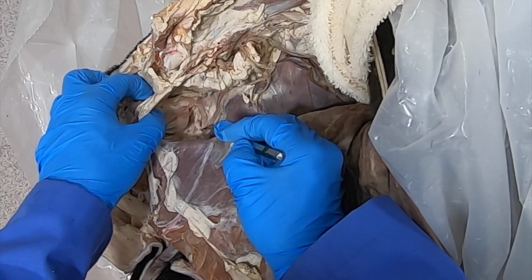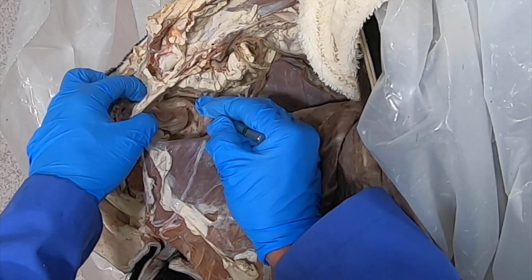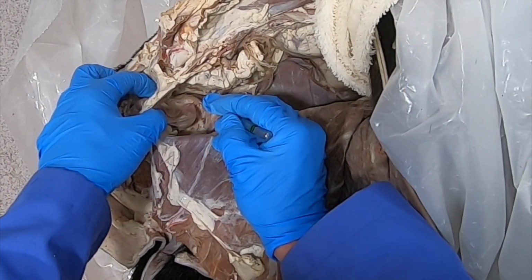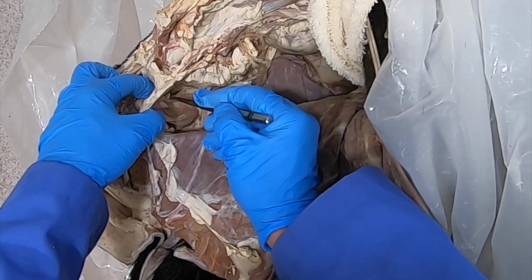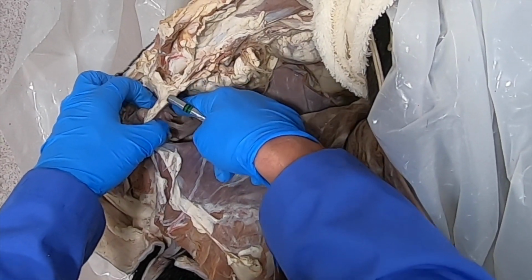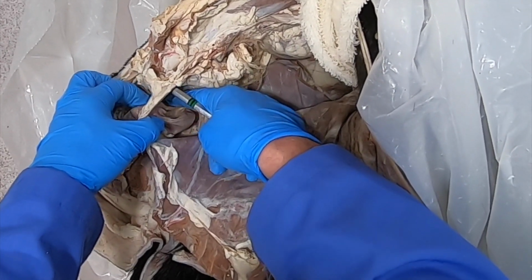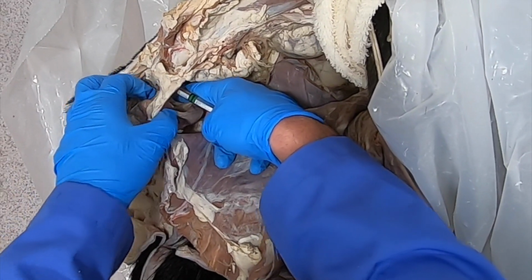You see the ductus deferens are coming up here, and they got this folded tissue between them, which is known as the genital fold. In the female, it would be the vagina and the uterus sitting here. Okay, so that between the genital structures and the rectum is the rectogenital pouch.